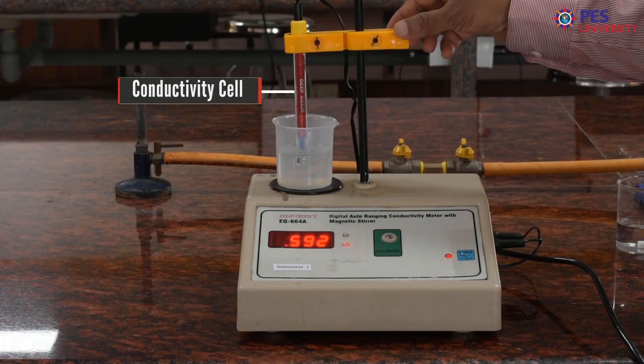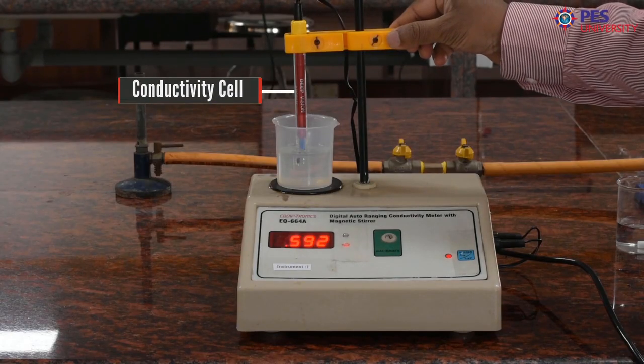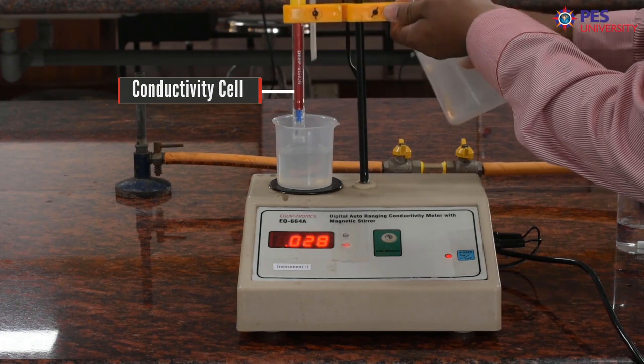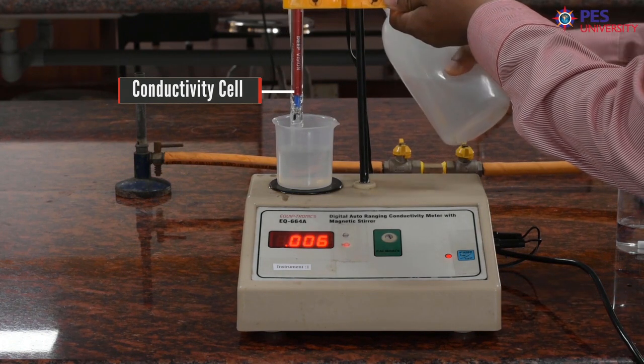Before measuring conductance of 0.1 molar KCl solution, let us rinse this electrode with distilled water like this.